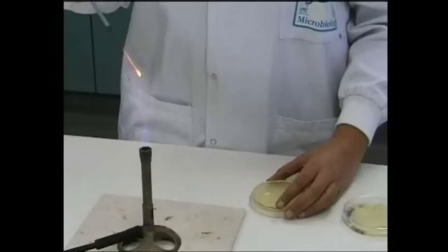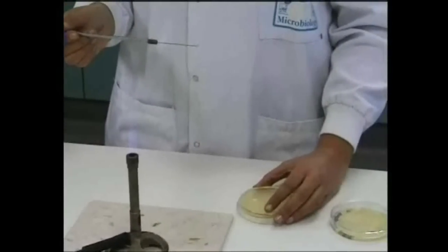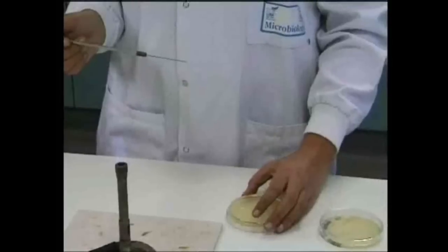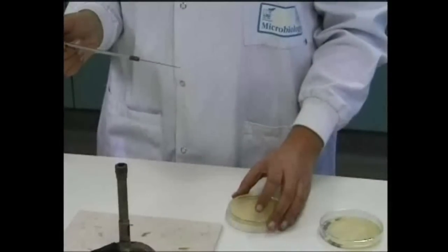After flaming the loop yet again, the final streak is taken by drawing from the third streak to the centre of the plate. The loop is then flamed once more.